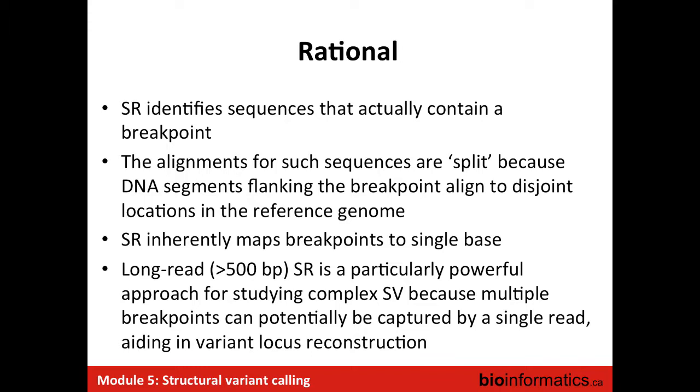People working with split read really recommend using longer reads, because you have more chance to split your reads. If you split your read at one end and you don't have enough sequence in one of the parts, you won't be able to map it. You will just cut your read and not know where the other part of the read will map. So the longer your read, the better the efficiency of the split read method will be.